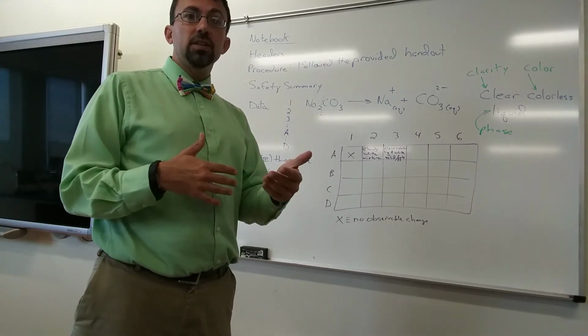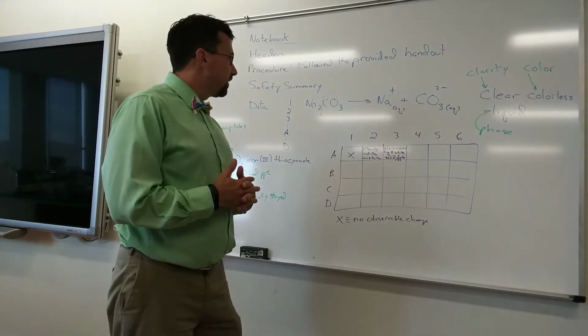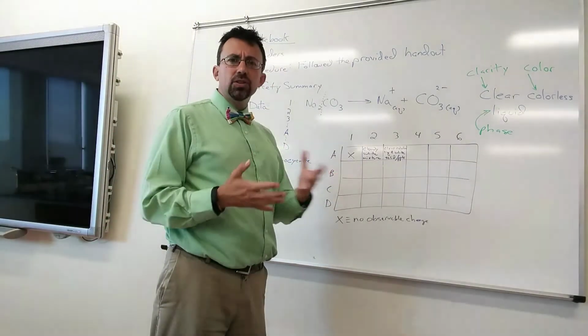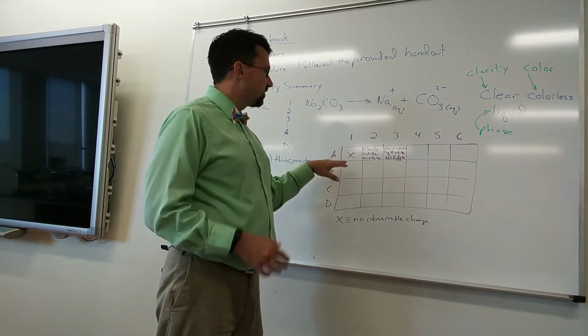if nothing's observed, nothing observed. Doesn't mean nothing happened. We could have missed it. It could be at a microscopic level. And there are other things, right? There could be a temperature change when we mix. There are a lot of things that could indicate a reaction other than just changing the clarity.